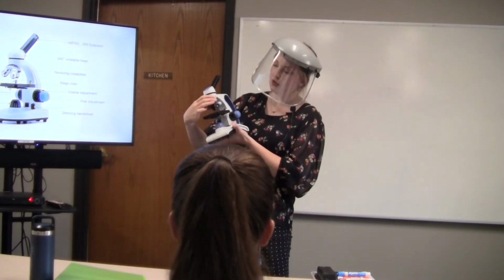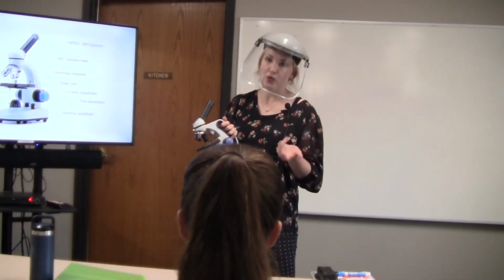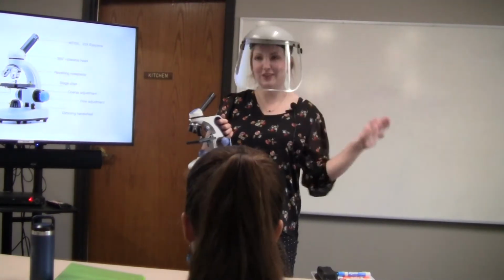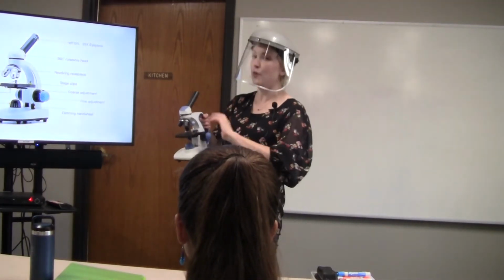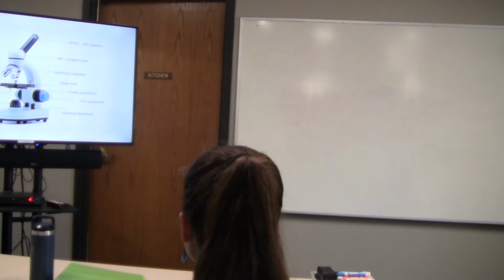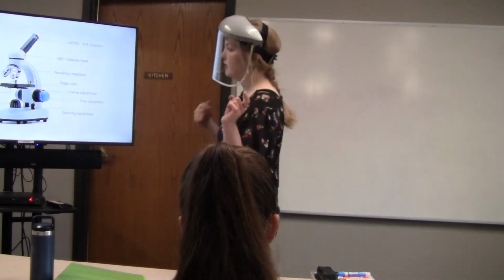Once you go up to the 40 times magnification, the blue, then you're in danger of crushing the lens if you use coarse adjustment. So coarse adjustment on the blue line is a no-no. Don't do it because you can crush the lens. That's a bad thing because it will go all the way up to touching the stage. So that's a little bit of instruction on how to go up in magnification and have the easiest time.